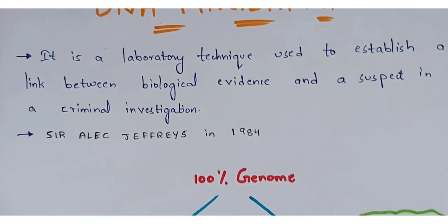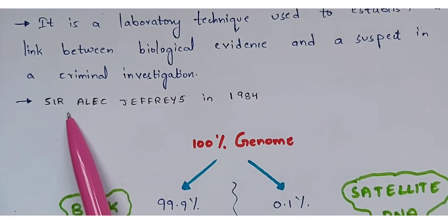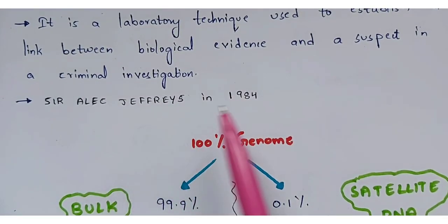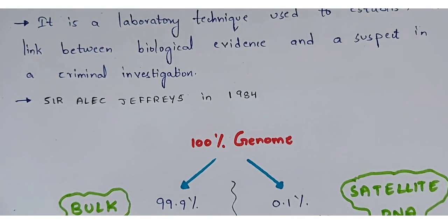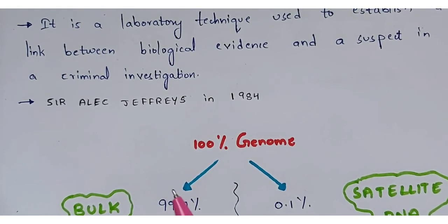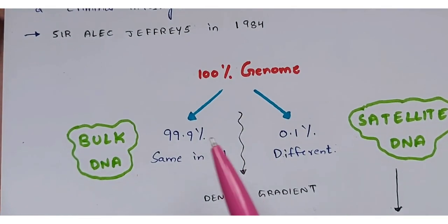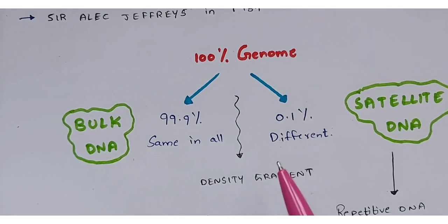Basically, this DNA fingerprinting technology was first developed by Sir Alec Jeffreys in 1984. In order to move towards the DNA fingerprinting procedure, I want to explain to you the introduction of this DNA fingerprinting. It is very important to remember.